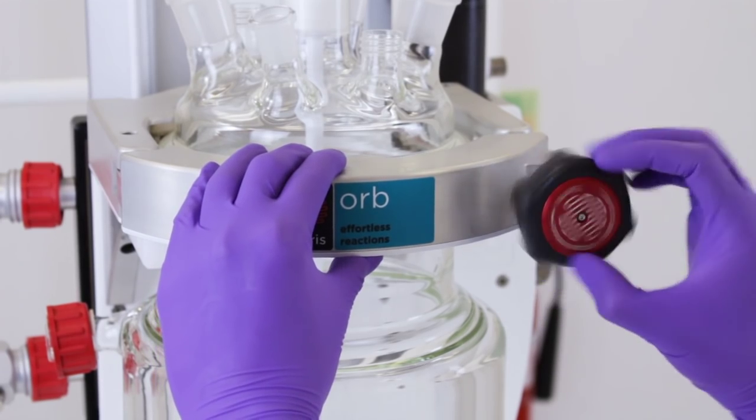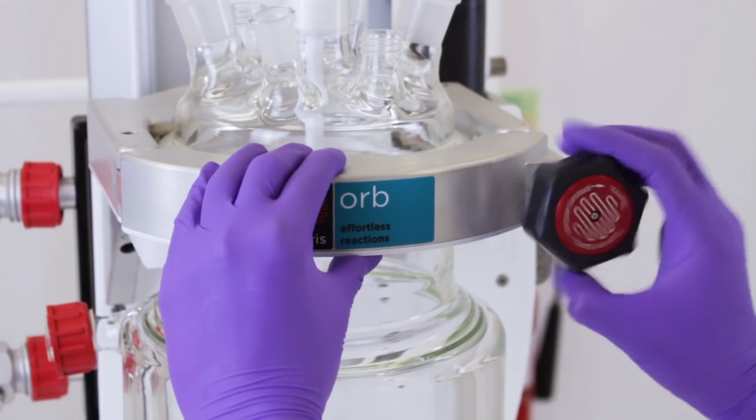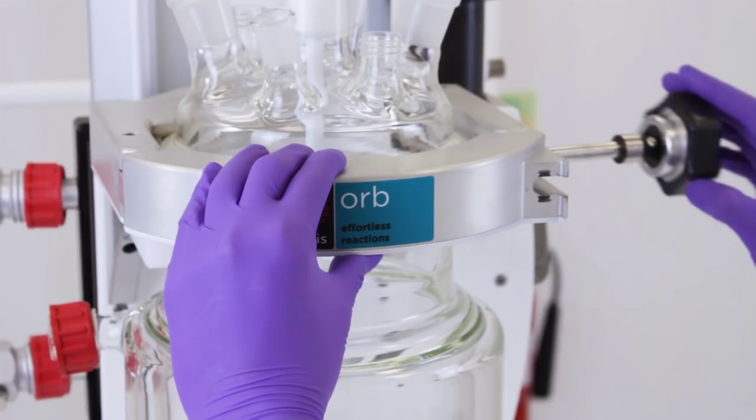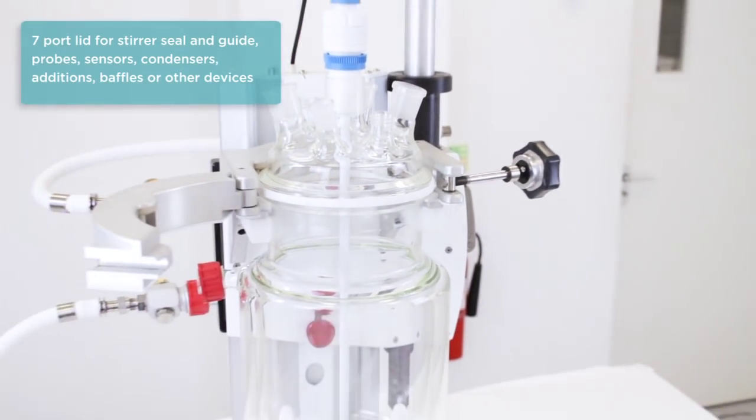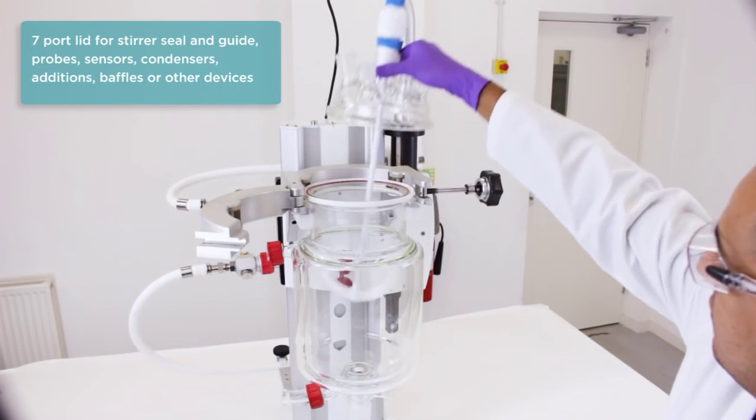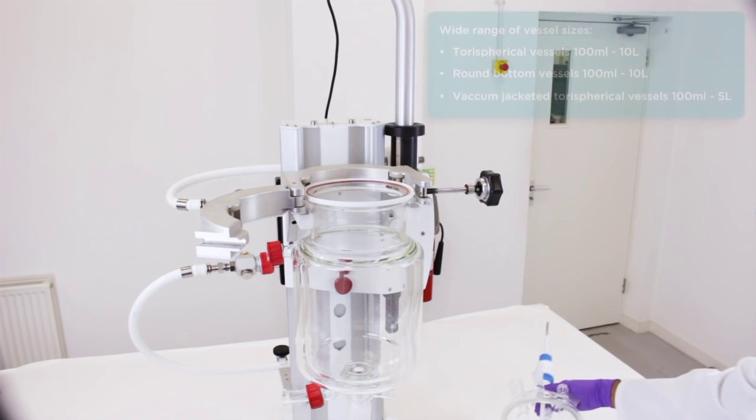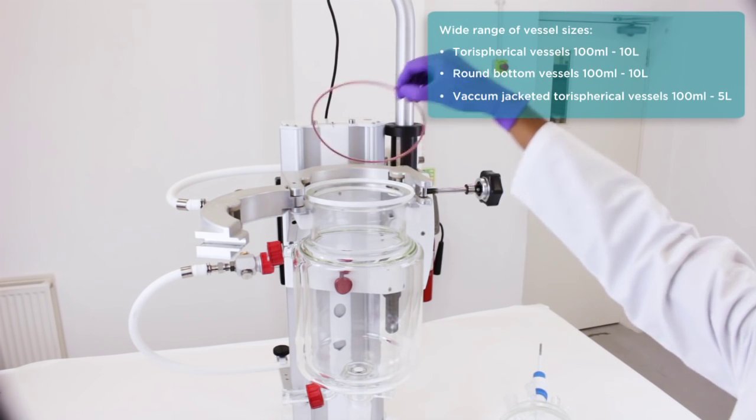The unique vessel clamp mechanism allows jacketed vessels to be added and removed without tools. The clamp can be opened by turning the clamp knob. The vessel remains in place with the clamp open and can then be easily lifted out and replaced.